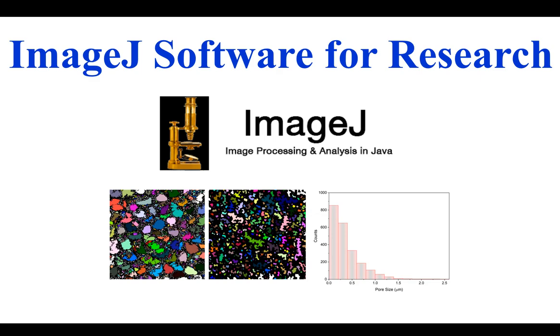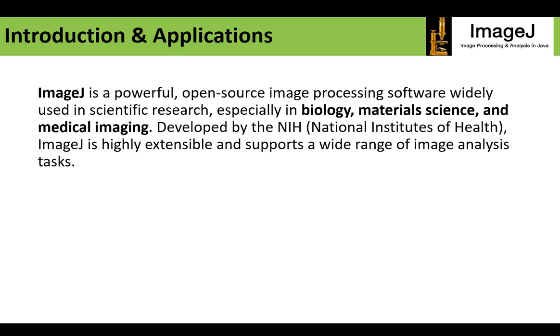Hello guys, so today we will learn something about ImageJ. This is very basic software which is used to analyze and process images. It's a very powerful tool and it's widely used in research, especially in biology, material science and for medical imaging.